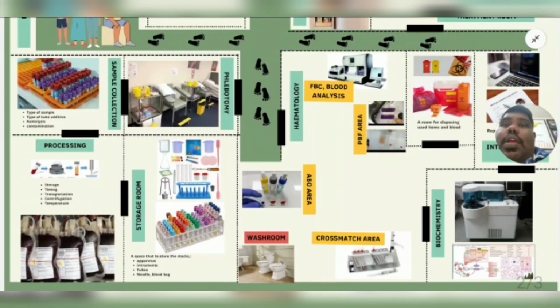Okay. And for both of these benches we need a place to dispose of waste. Gloves and the like will be waste that we can put in the green color bin. And any material related to blood, any needles, or any material that has been exposed to bacteria, urine or something similar, we need to dispose of in a yellow bin.